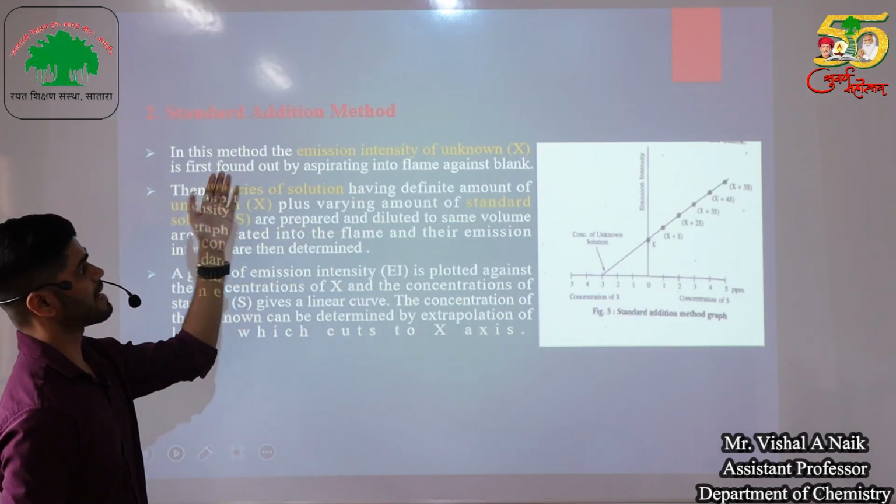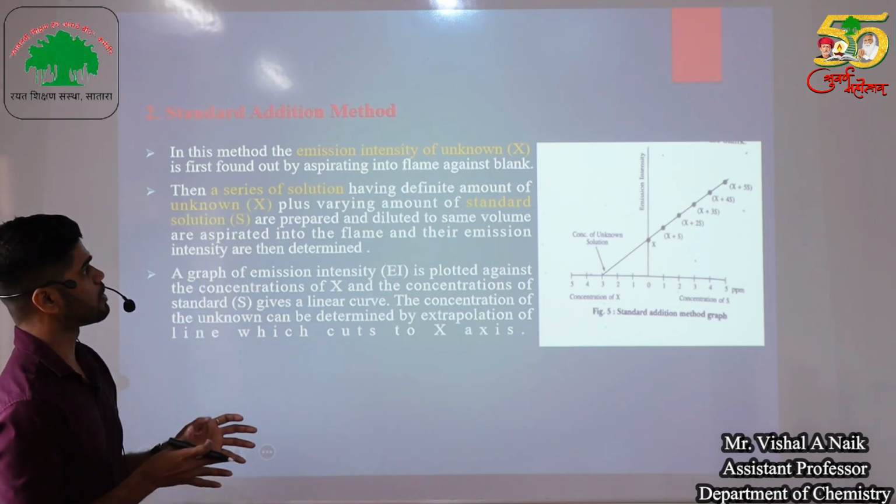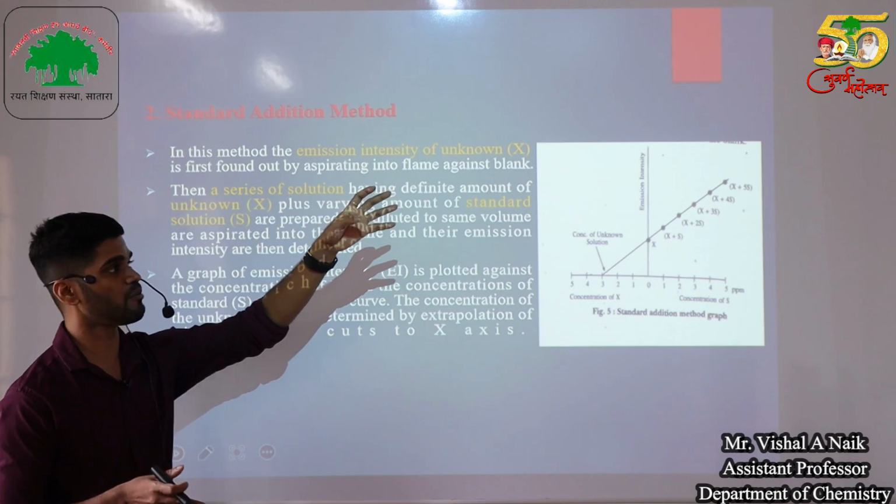Then the next method is the standard addition method. In this method, the emission intensity of the unknown solution is found by aspirating it into a flame.